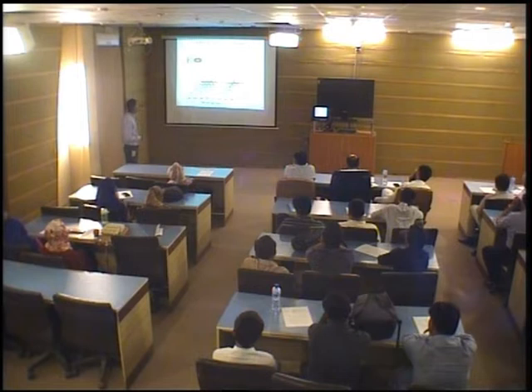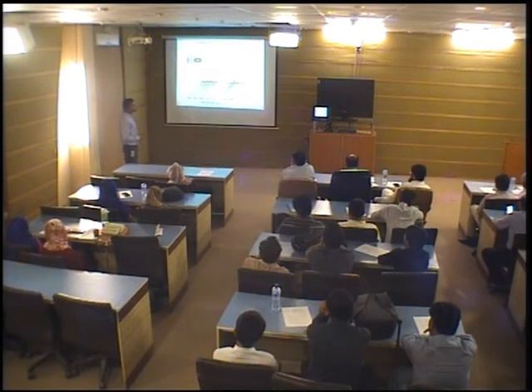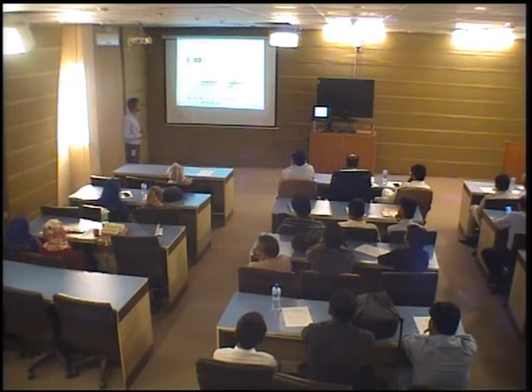So let's suppose this is our target material, and this is a plasma plume generated on the surface of the target material. We put our spectrometer or optical cable near the core of the plasma. We did not change the spectrometer, but we only change the delay time. Delay time is basically the time gap between plasma generation and light collection. As the delay time increases, the excited electrons or species continuously de-excite, due to which the intensity of an emission line continuously decreases.